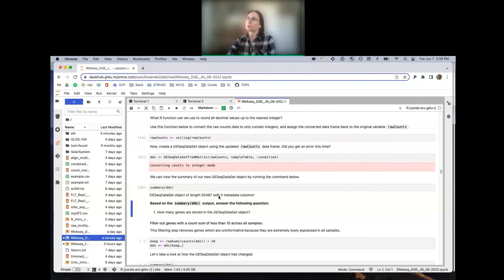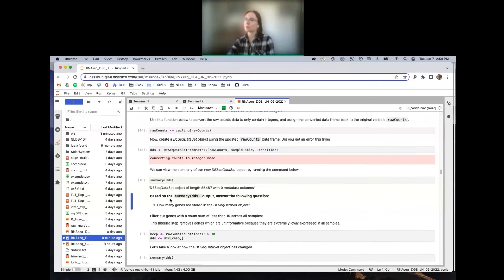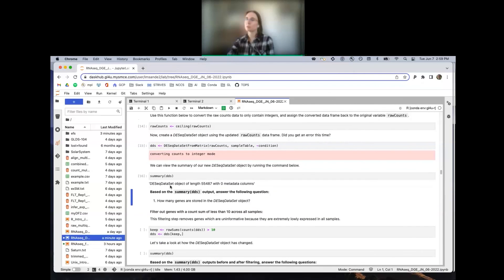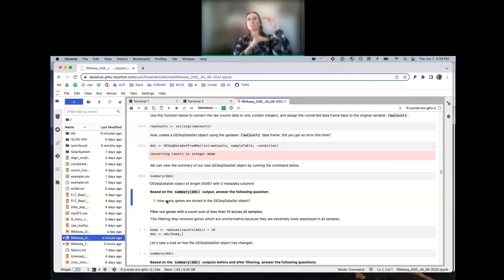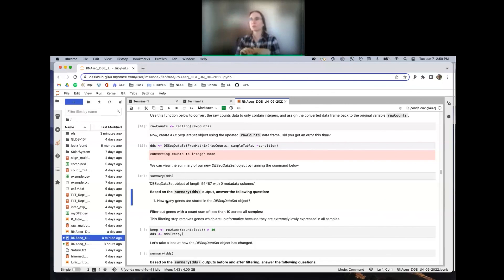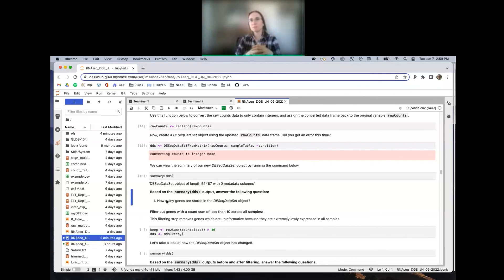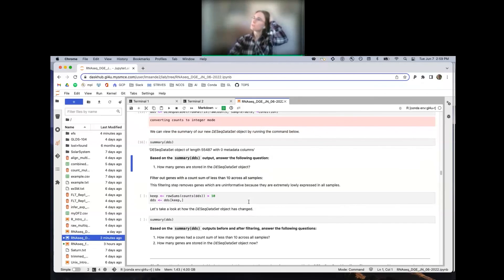The reason the DESeq2 dataset object is discussed in terms of 'length' is because the calculations we're going to do are on a gene-by-gene basis — for each gene, we ask whether it is differentially expressed. There's a slot for each gene where new information will be put, like a p-value. So DESeq2 thinks of the dataset object as having a length where each unit of length is a different gene.